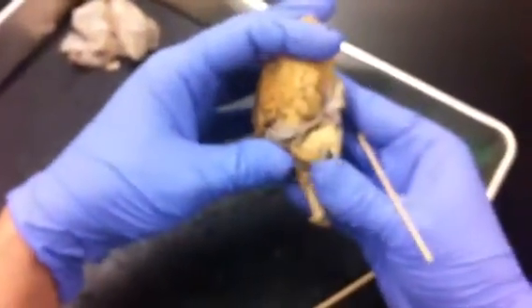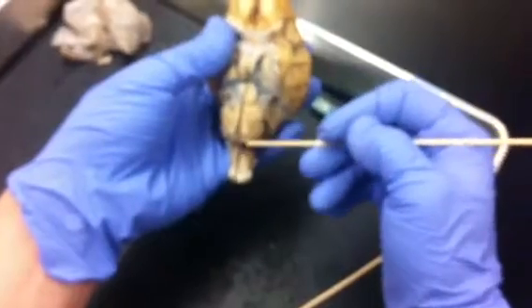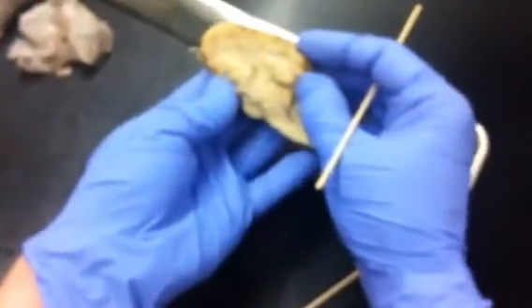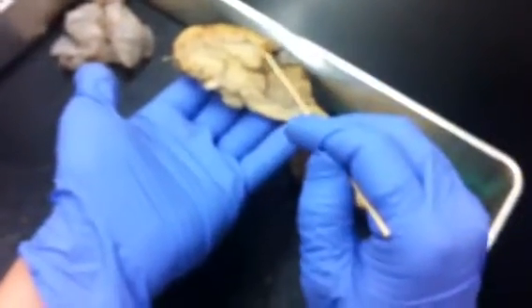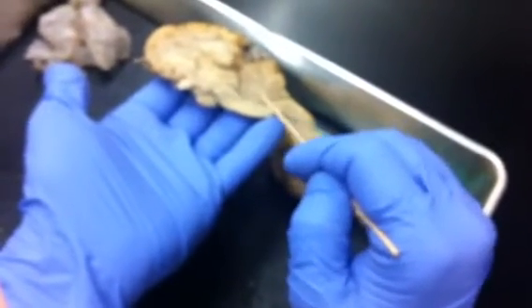Yeah, because over here the cerebellum's going to start to get in the way. So do pons, medulla oblongata, spinal cord. Yeah, because you can see the separation better here. Okay, good. Okay, so frontal lobe, parietal lobe, occipital lobe, cerebellum. This white that you see in there, arbor vitae.